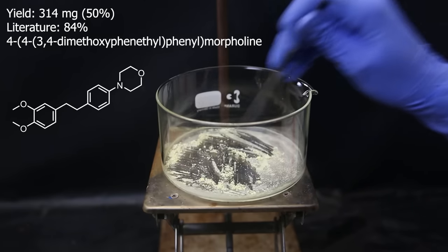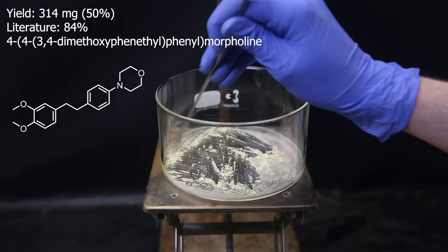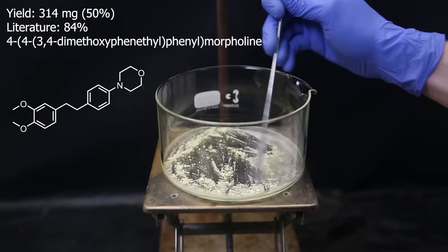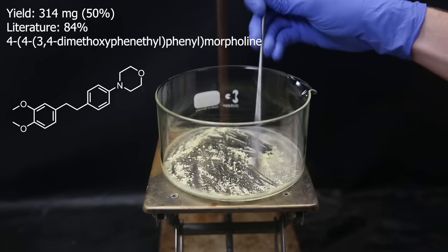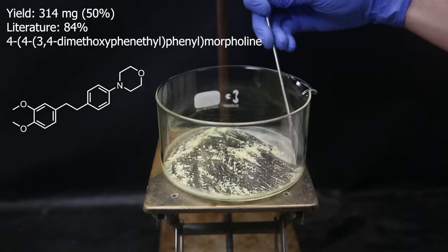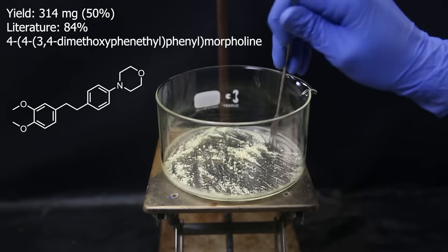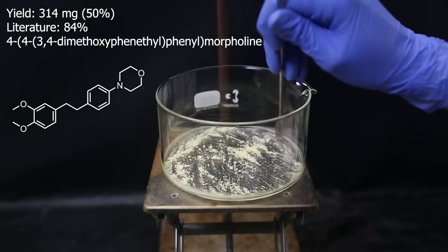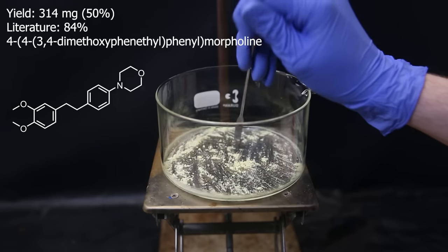And to be fair, this comes from a respected research group, so there was no doubt. Organic electrochemistry is quite uncommon to come across and not really something you would find in pretty much any synthesis. It is still a scarcely researched subject, but now with increased standardization like with the ElectraSyn, it allows for easy replication and research into new transformations. So in the future, we will probably see electrochemistry being more common in organic synthesis. Since it is so simple to set up, it allows you to skip many steps, and a lot of the time having a better yield. And everyone wants that.